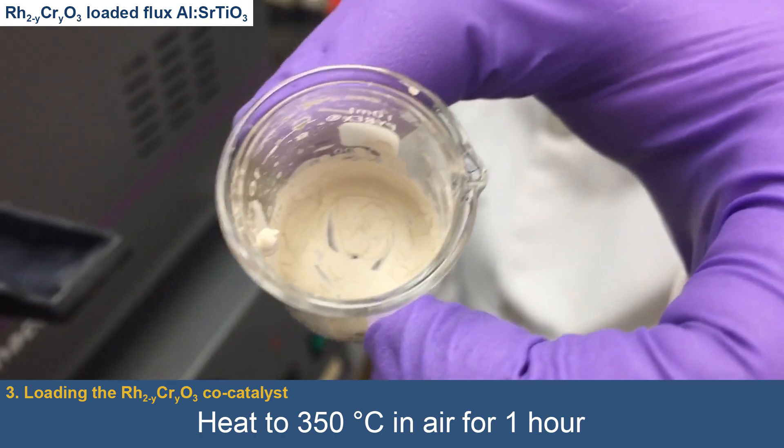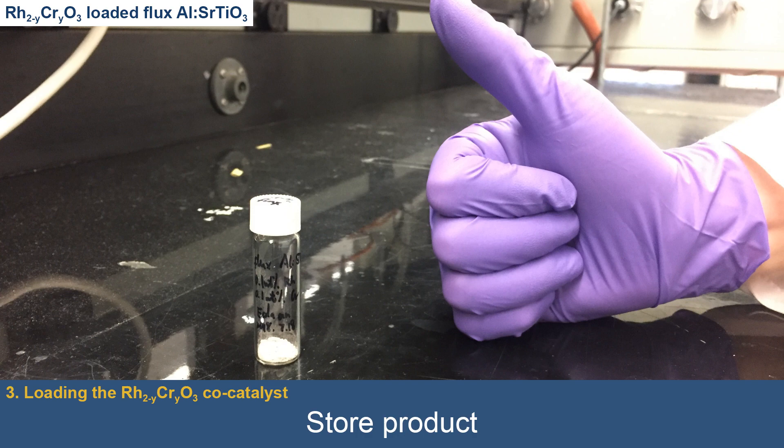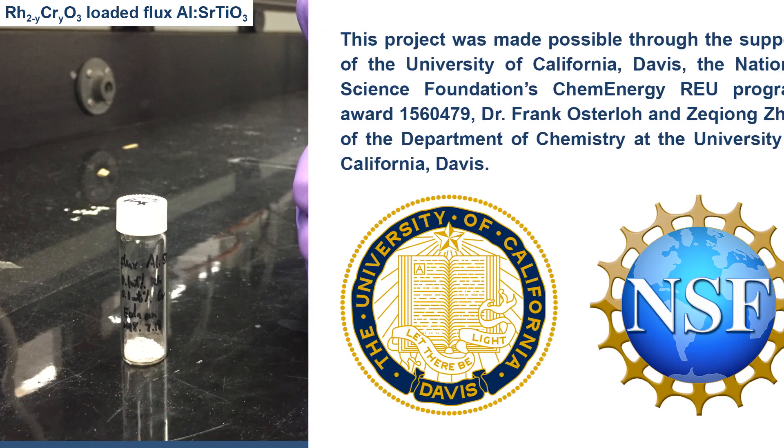These microparticles can now be used for hydrogen fuel production via solar-driven photocatalytic water splitting.